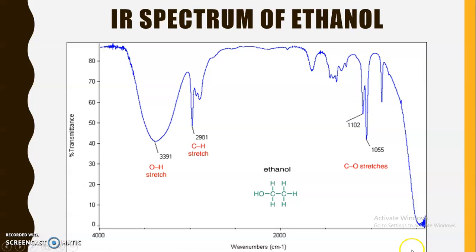This is the wave number. It is very difficult to remember the wavelengths, because this region has very far infrared wavelengths. Wave number is directly proportional to the frequency, and it is expressed in much more convenient numbers, and that's why they are represented in wave numbers.